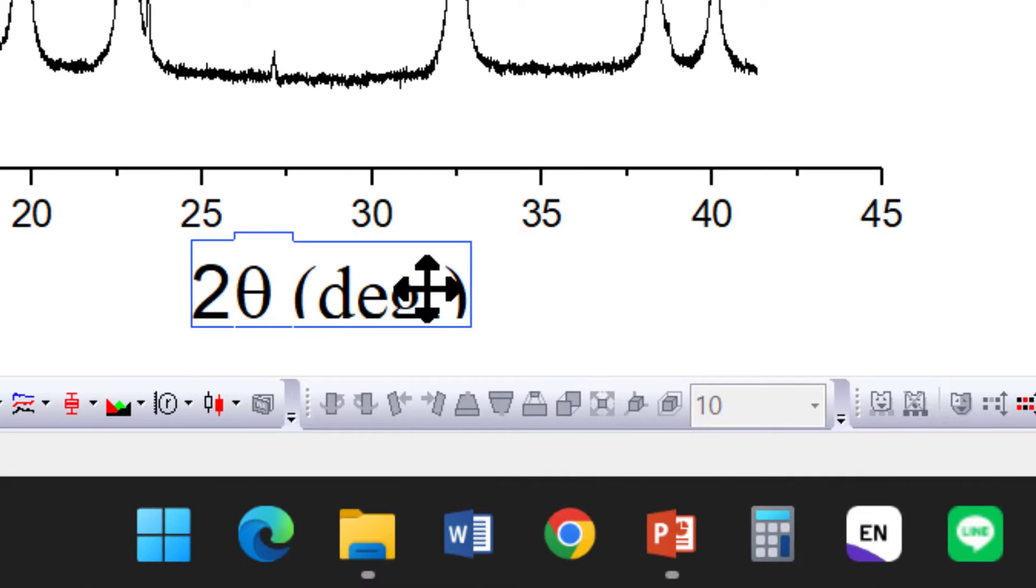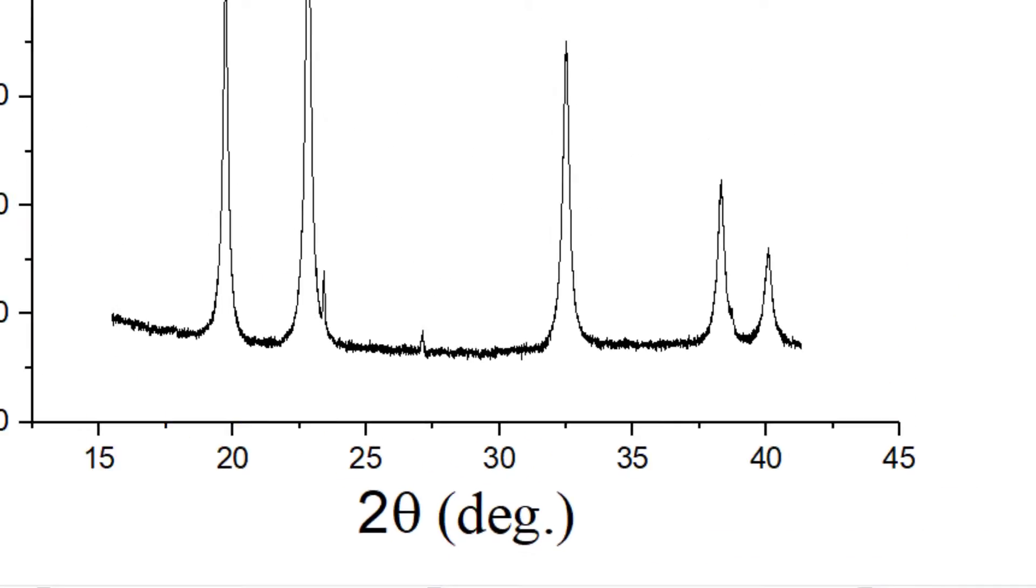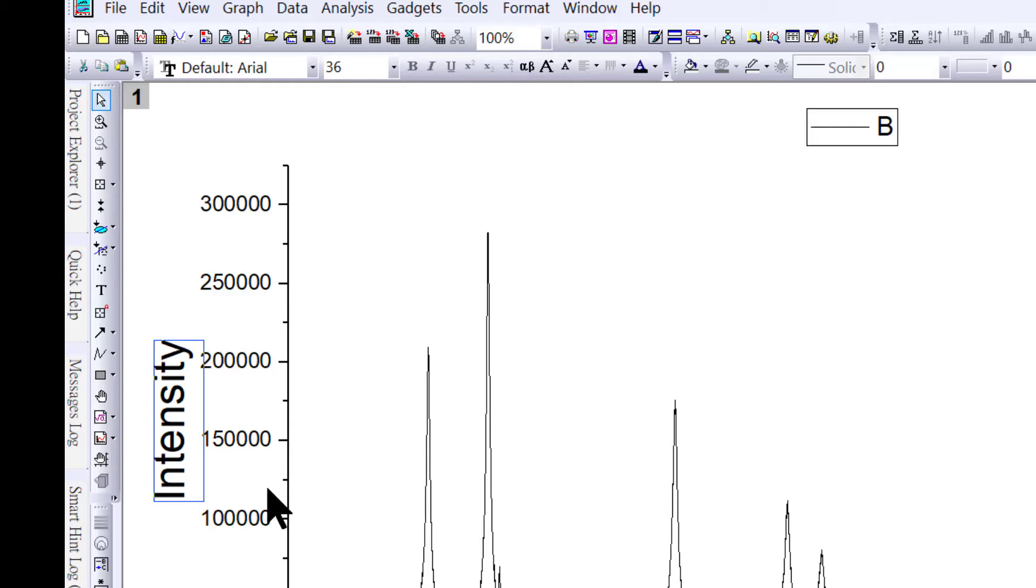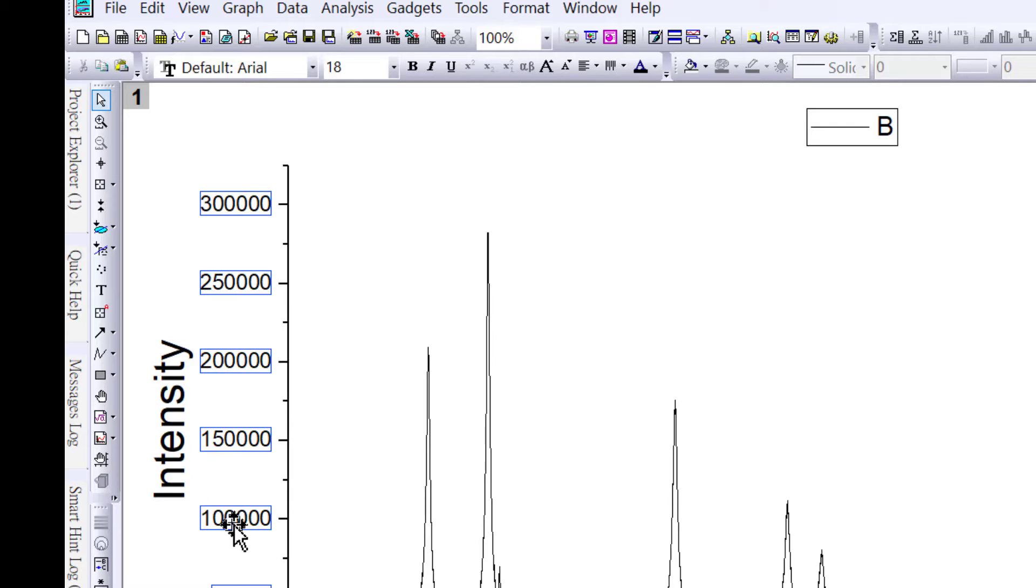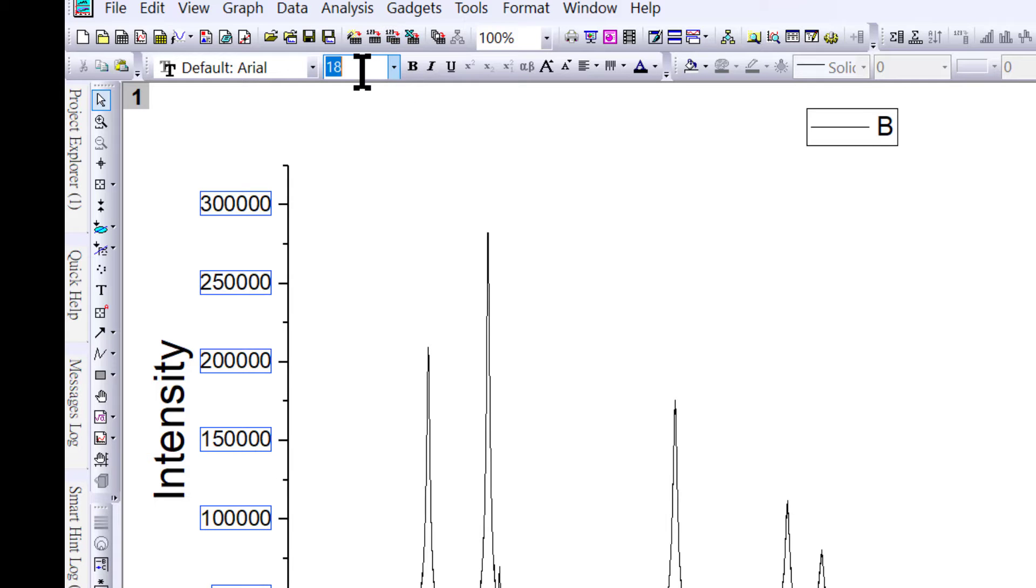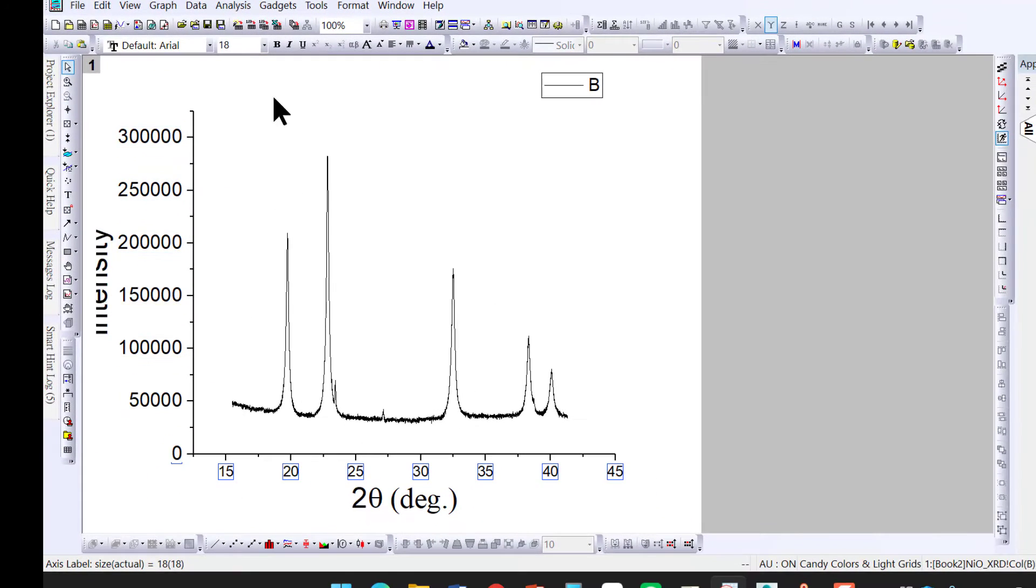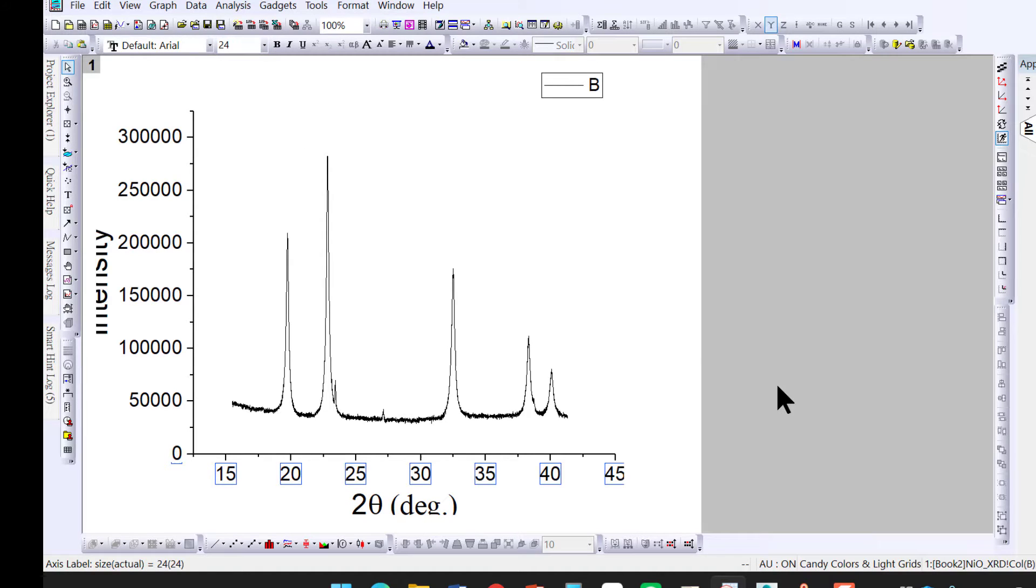Similarly for intensity, keep the same font size of 36. To change the font size for the axis numbers, I would like to have 24. Similarly, set it to 24 here as well.